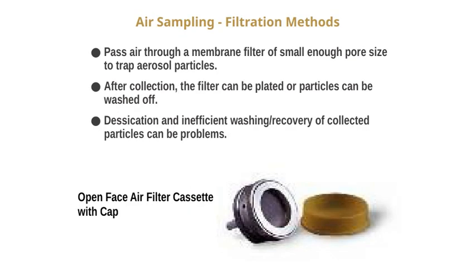Let's talk about air sampling using filtration methods. The basic idea is to pass air through a membrane filter that has a small enough pore size to trap aerosol particles. This way, we can effectively collect the particles suspended in the air. After the collection, there are a couple of options. We can either plate the filter directly to culture any microorganisms or wash off the particles for further analysis.